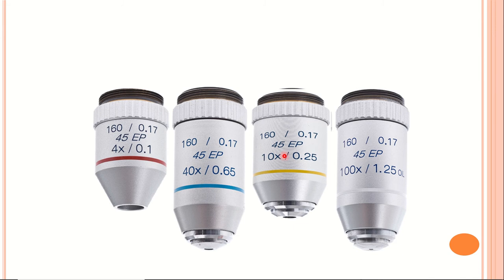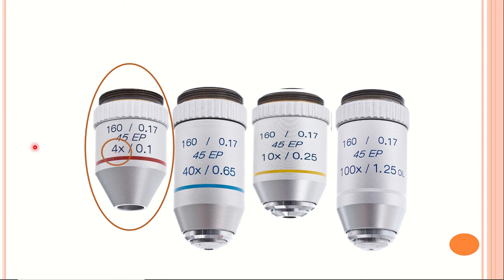This objective has the lowest magnification, which is 4X, has a short size among other objectives, and contains a red color. This is what we call the scanner.